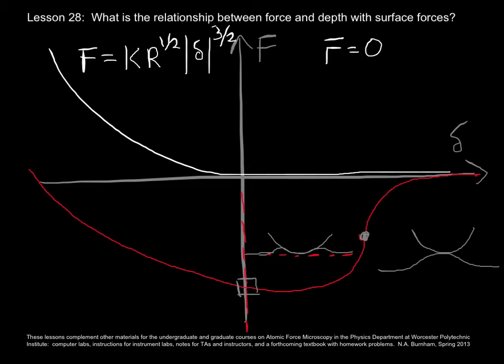And here, this is where the cantilever is applying no force, and the indentation depth is due to surface forces alone.